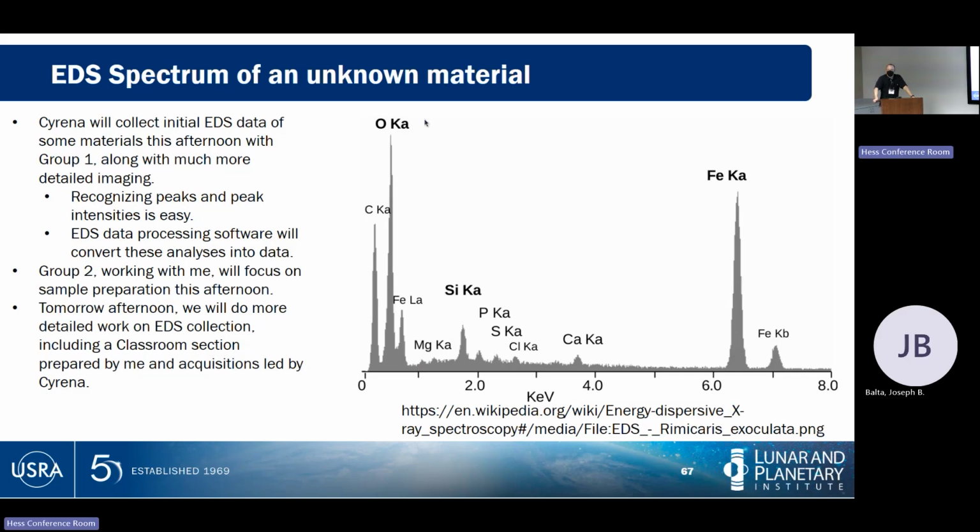The groups today will focus mostly on... Group 1 today will focus mostly on image acquisition, image processing, and such in the afternoon. Group 2 with me will work on sample preparation and different types of sample prep and how to think through sample prep and all sorts of questions like that. Then we'll switch and do the opposite things in the morning.